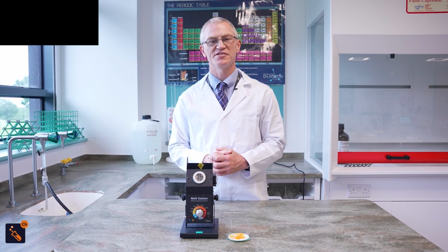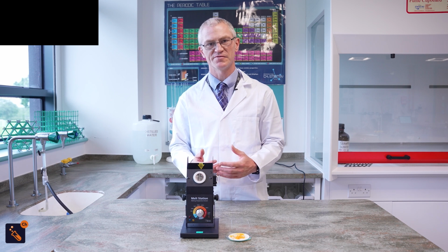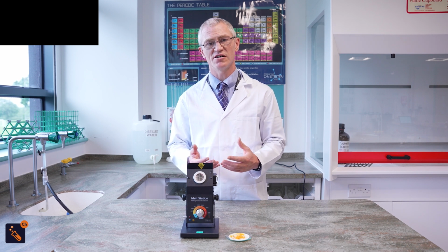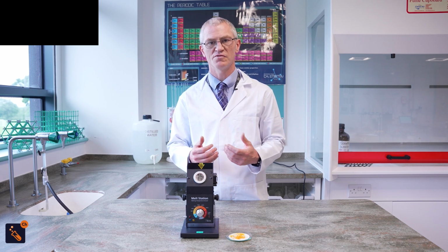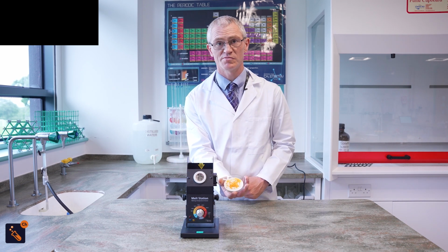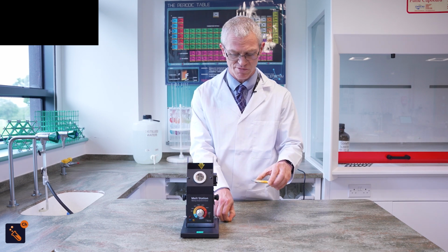We're now at the last stage where we identify our 2,4-DNPH derivative. Then we can know what the ketone or the aldehyde was at the start, because there is a database online which shows you the exact melting point of derivatives of different aldehydes and ketones with 2,4-DNPH. Now we have our product here, and you can see our nice orange precipitate. That orange precipitate can be loaded into a melting point tube.